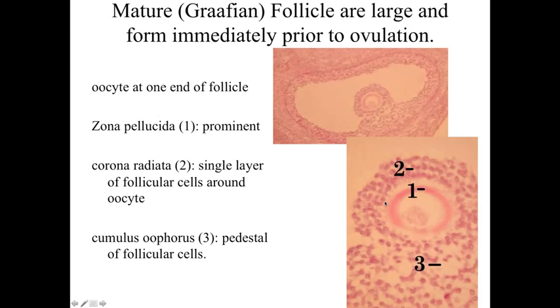The mature or Graafian follicle is going to become FSH independent. It's going to be very large, forming immediately prior to ovulation. At higher magnification, we can still see the oocyte with the very prominent zona pellucida surrounding it. A single layer of ovarian follicular cells form the corona radiata, which will be ovulated with the egg. The other follicular cells form a cluster called the cumulus oophorus — a pedestal that keeps the egg and corona radiata anchored so they're not floating free within the antrum.